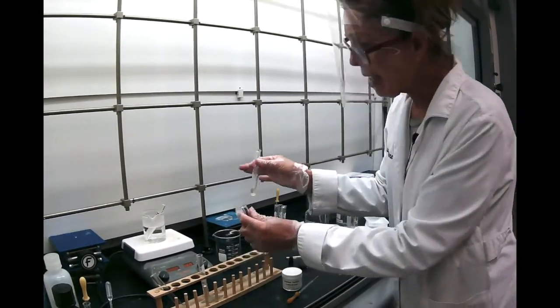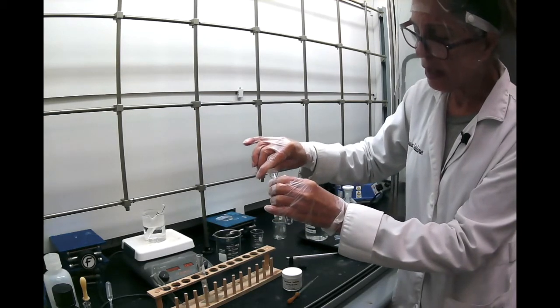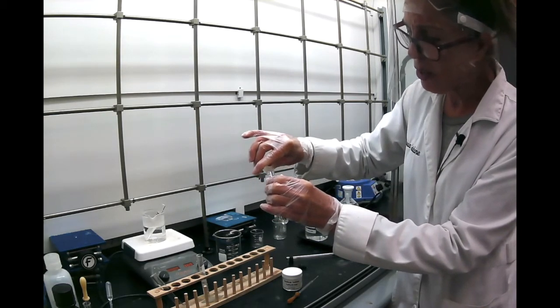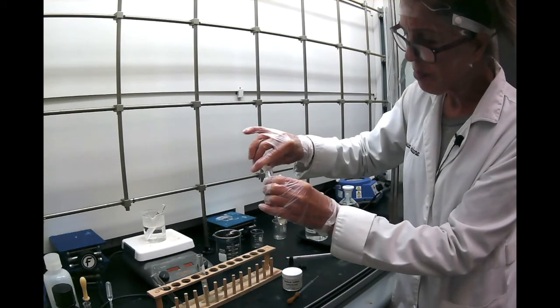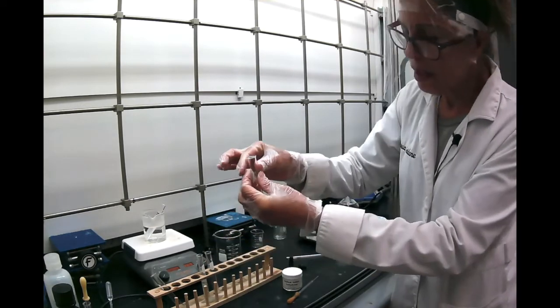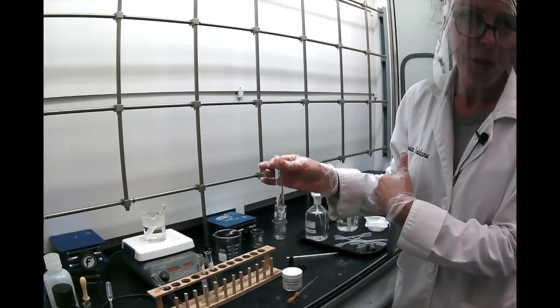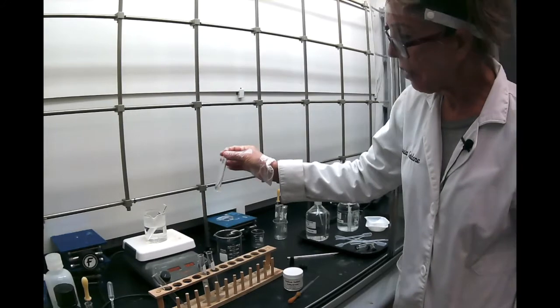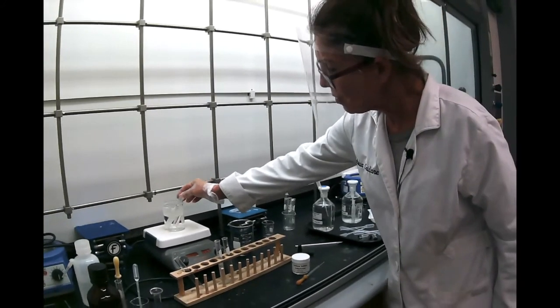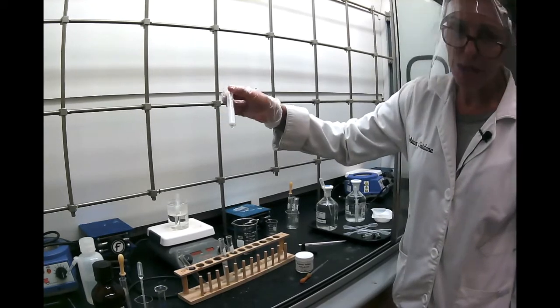Now, what's my last step is to transfer my organic layer in a clean pre-weighed test tube. So what I did earlier is I did weigh this test tube to know later how much benzoic acid is in there. And I just need to let it dry, evaporate, and this is the previous test tube.